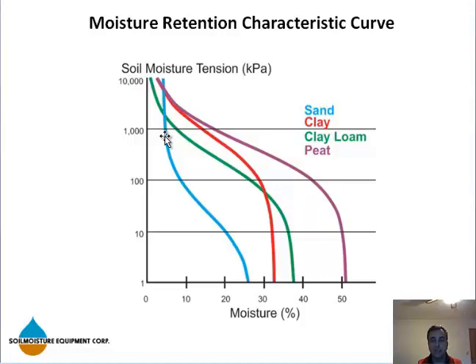And the other thing is that your pressure range might be different. Sometimes it's from 0 to 1 bar, sometimes 0 to 5 bar. And if you are doing the whole range in agriculture, it is 0 to 15 bar, which basically is known as the permanent wilting point. Most plants and crops die at that point, so there's no point in going beyond that pressure. That is why our extractors can go up to 15 bar maximum.